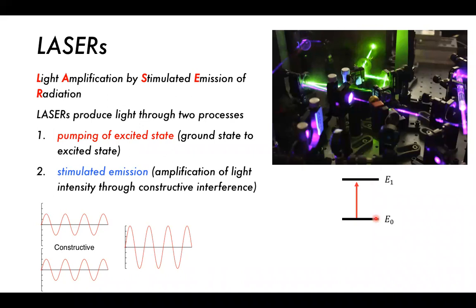So it's not that dissimilar in a sense from the light that's produced from a hollow cathode ray tube, but the difference is that this one produces much more intense light, and it's not necessarily one element for one species. You can use the same laser for multiple different elements or multiple different molecules. So it's another way of generating light.